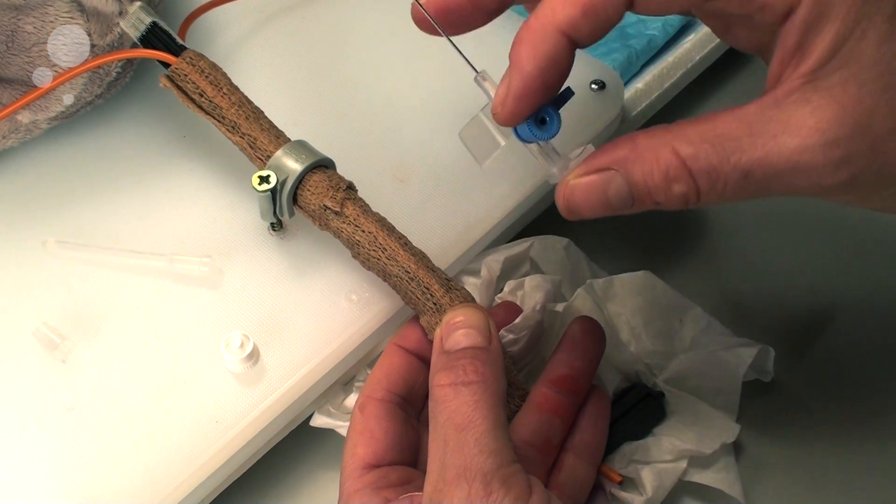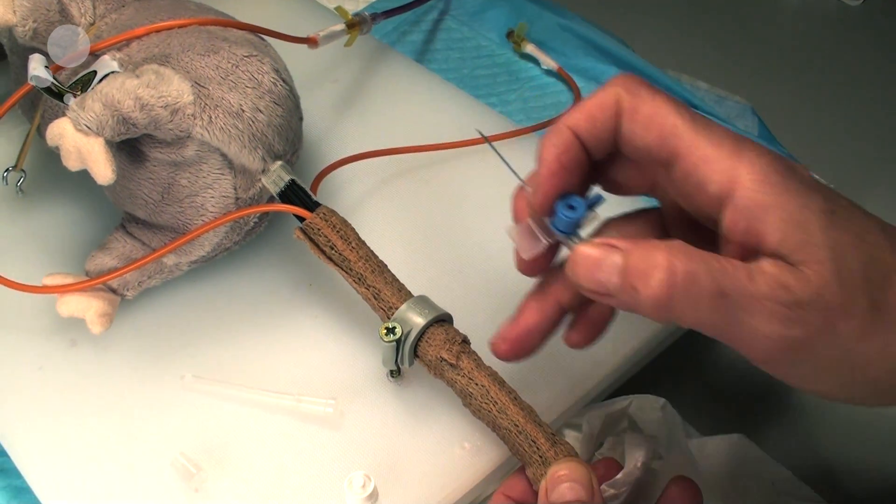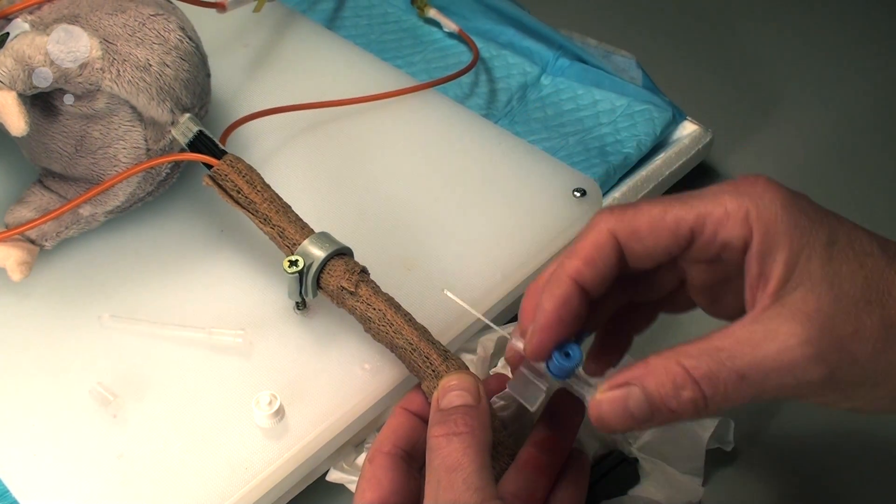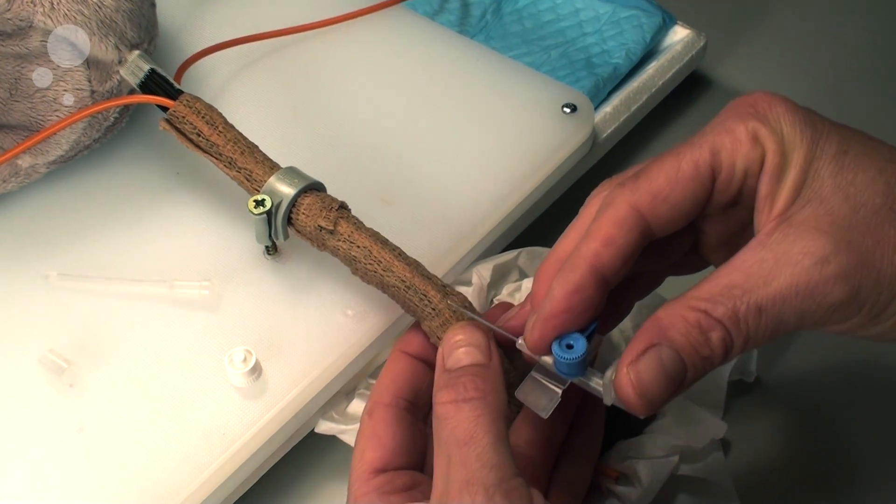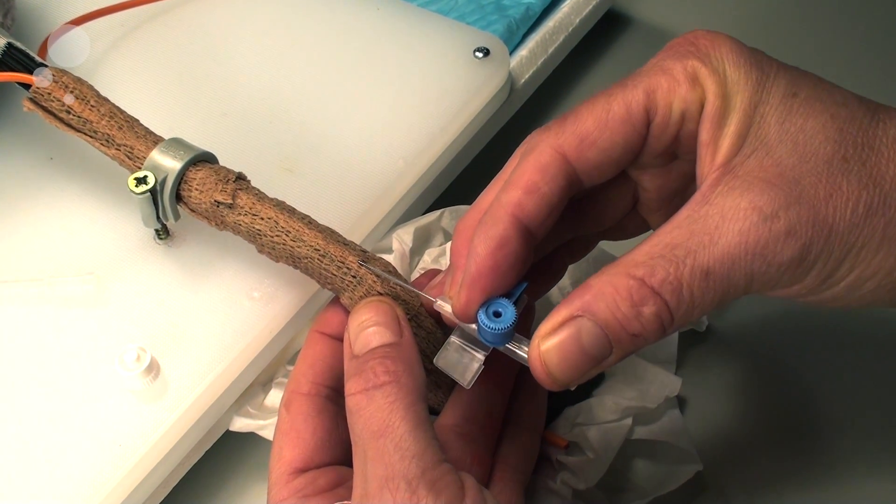When you work on the tail vein of a rat to put in the catheter, go out two-thirds of the way before introducing the catheter. You need to go like this, introducing it into the vein.